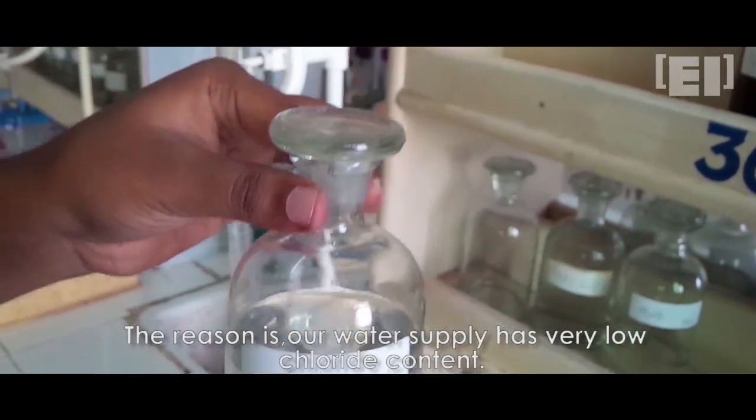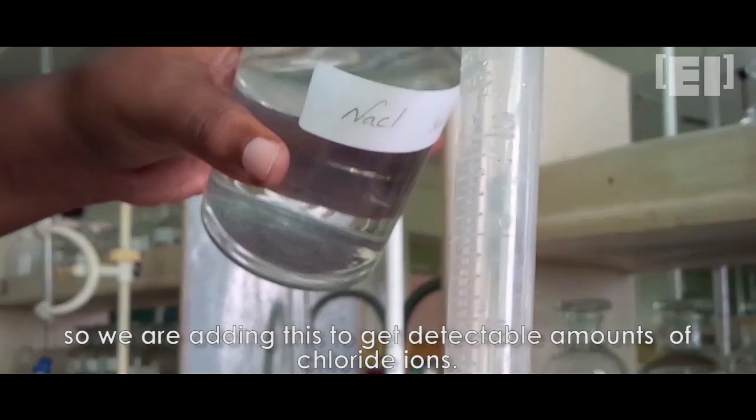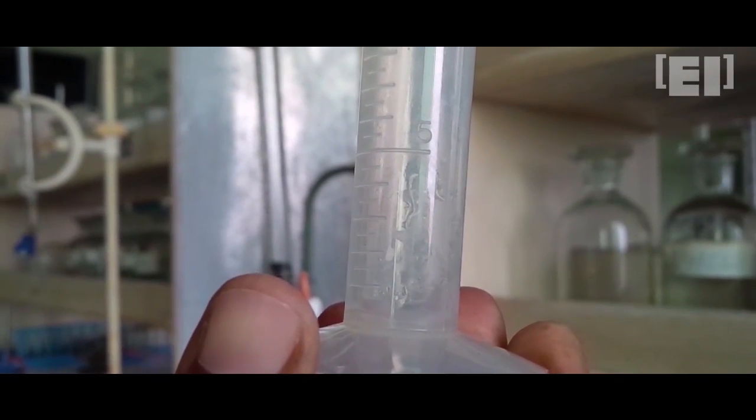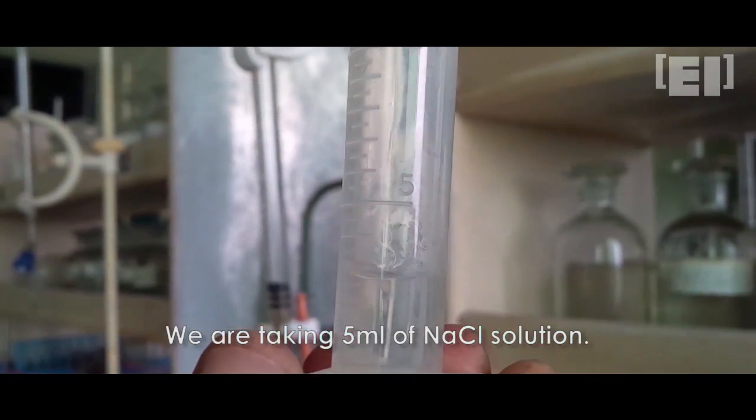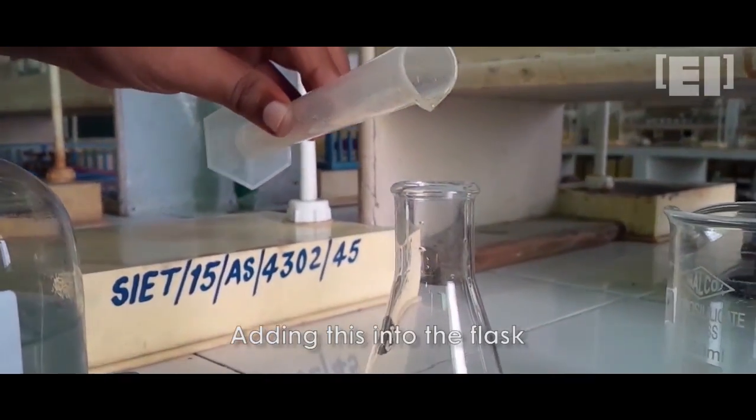Our water supply has a very poor amount of chloride ions, so we are adding external chloride ions. So taking 5 ml of NaCl solution in this cylinder, we'll pour this into the flask too.